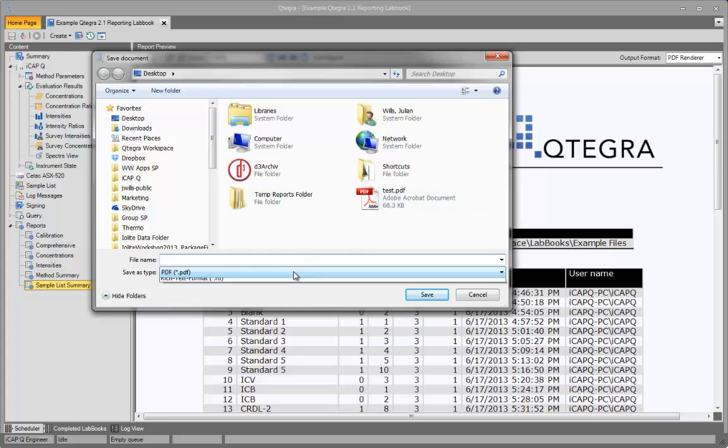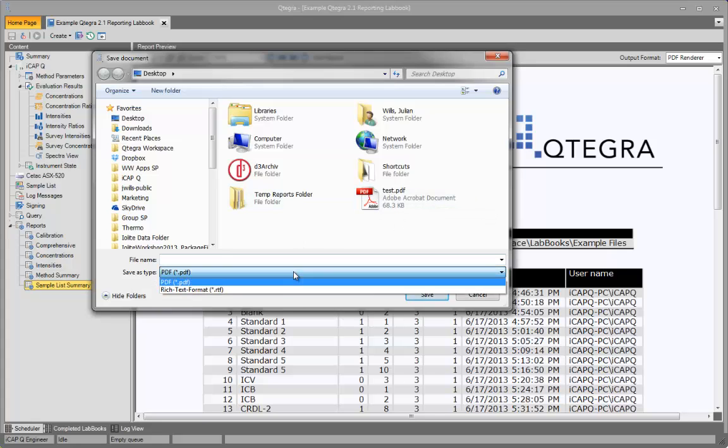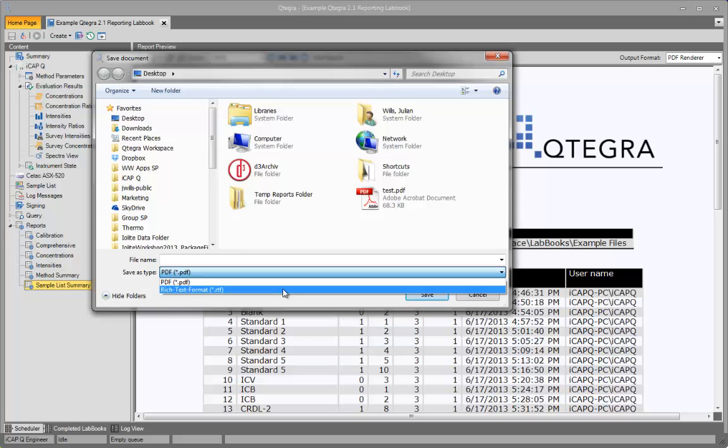The report output from the labbook can be saved either as a PDF or as an RTF file that can be opened up by any text editor, Microsoft Word for example.